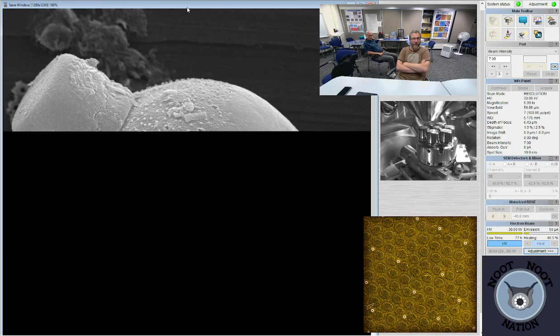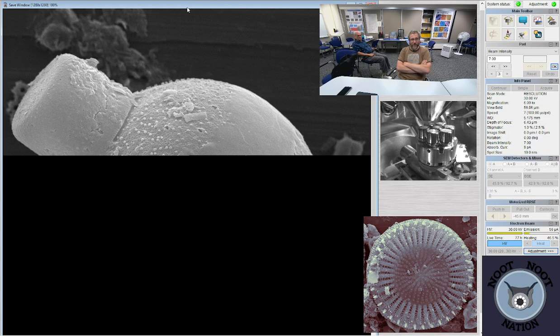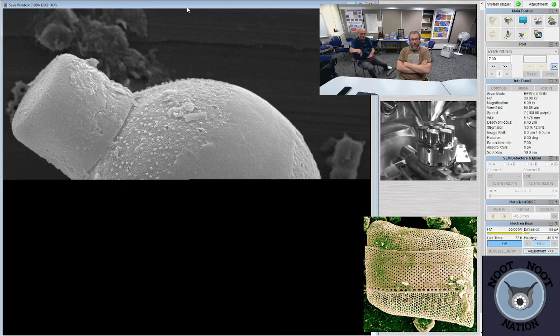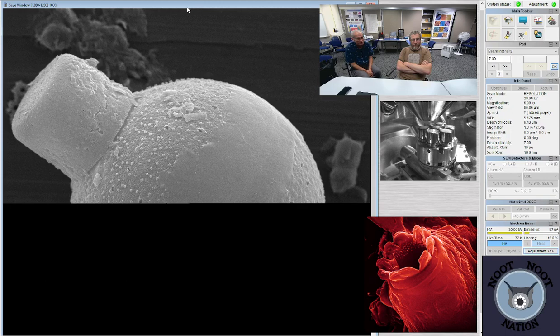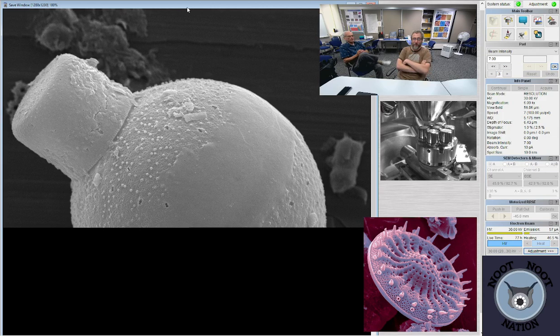I saw a Zeiss $1.2 million SEM. Did you pick it up? Brand new. It has a laser, and it can cut through, and then take images on the side, and you can put it together in 3D, like a CT scanner. Just amazing for micro-sized things, and it can freeze dry things too. And it has to be frozen. Well, you should have gotten us two of them, one for you and one for me. And it has a huge, circular screen. I mean, we could get a bigger screen.